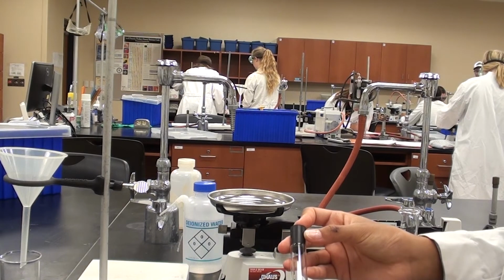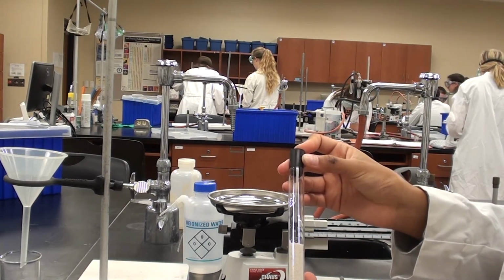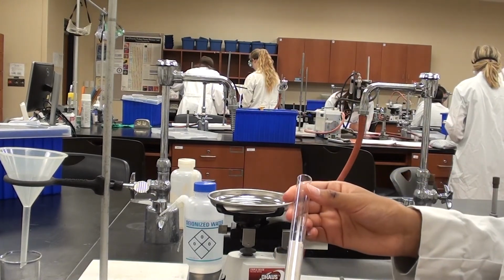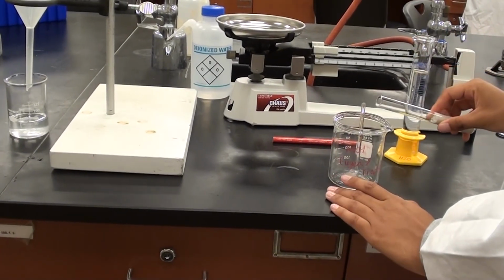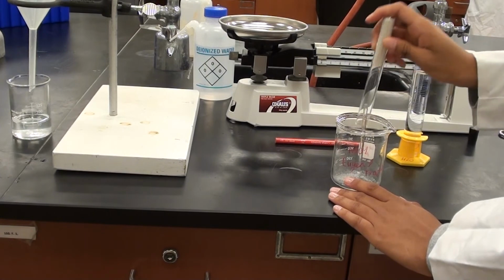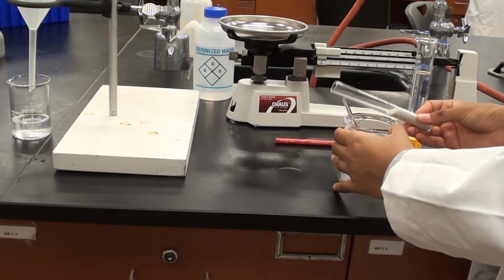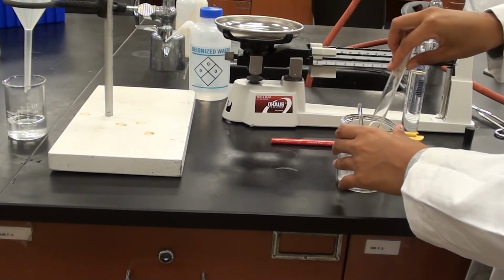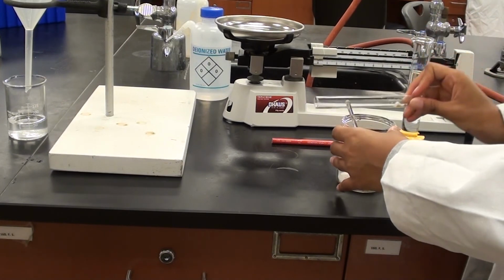So as you can see, this is our half empty test tube. Would you take the lid off please, since we've been weighing it without the lid? And now what Sabrine is going to do is she's going to pour that remaining sample, this is the second trial, into the beaker. You can tap it against the side a little bit while it's turned upside down. There we go, that's perfect. Okay, see, just a little bit of a tap and you can get most of the stuff out.